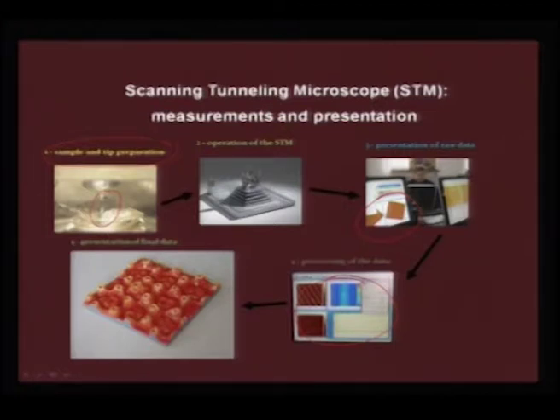You can do line scan. I will show some examples of what you can learn from such STM pictures, and then finally you can come to a presentation of data in 3 dimensions or in 2 dimensions. So, this is exactly the way you go about recording the STM pictures.